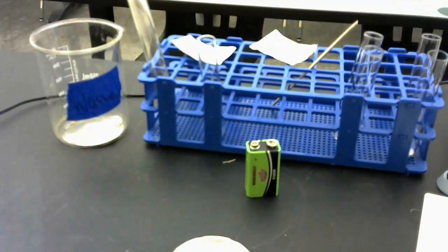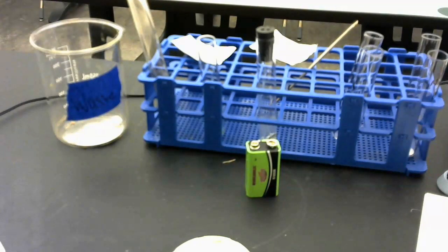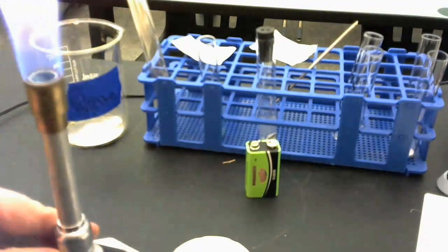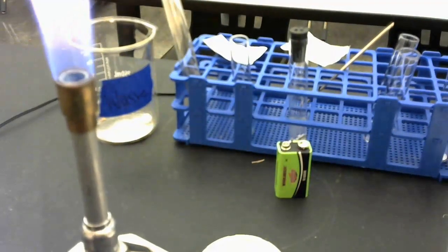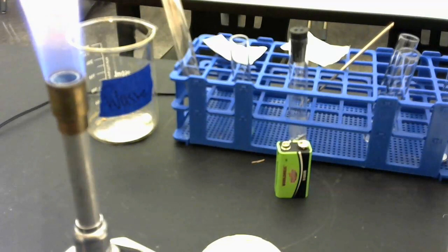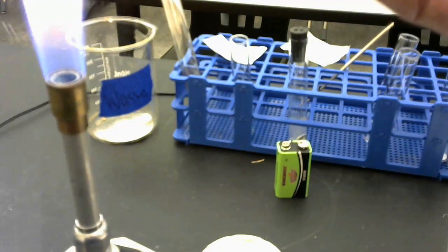Now, since my zinc and my hydrochloric acid are reacting, I'm going to go ahead and start my Bunsen burner again. And when I start my Bunsen burner, I'm going to use it for another wood splint, okay? So I started my Bunsen burner real quick, and I'm going to add a wood splint to that so that I can get a flame into my hydrochloric acid zinc solution, okay? And I'm going to stop talking real quick so you can just make observations of what happened, okay? So I'm going to light this on fire.